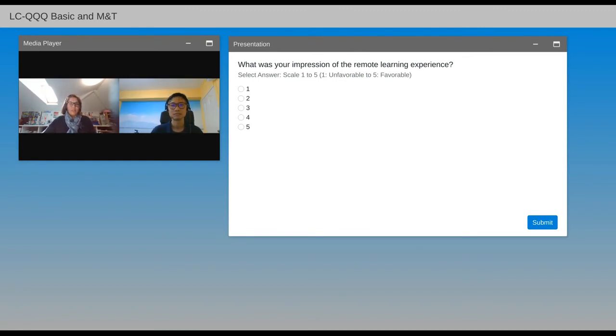So Kelvin, first question is, are there any databases for the LC Triple Quad applications?